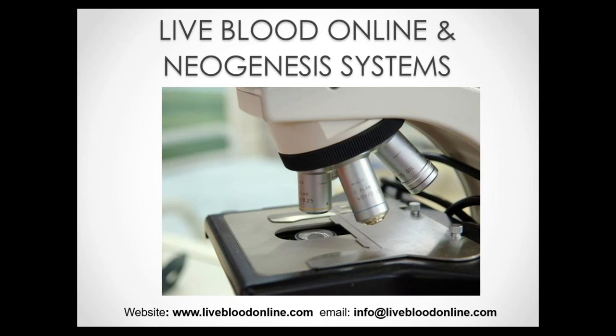Now, this is also one of the main reasons why live blood analysis is not really fully accepted by the conventional medical field. We are using a device here that can actually detect conditions that conventional medicine does not recognize as being real conditions. So, for example, candida, or the need for detoxification, heavy metal toxicity, latent tissue acidosis, and so on. So we have a tool here that can actually accurately detect those conditions. So, it's going to be very difficult and rather unlikely that it would be accepted by conventional medicine.